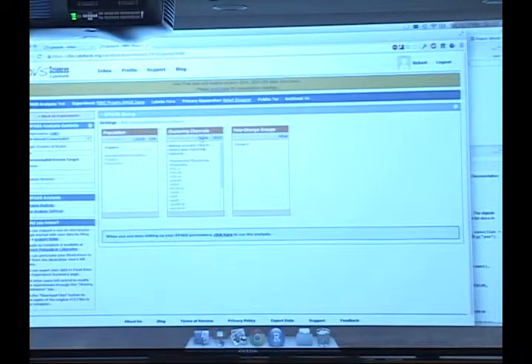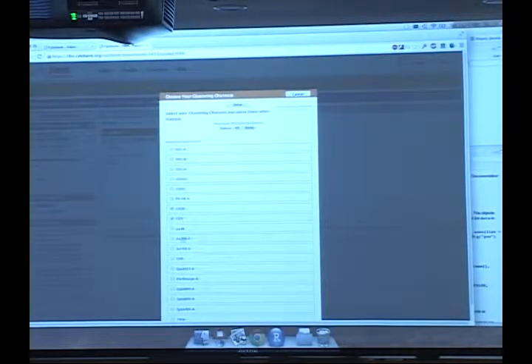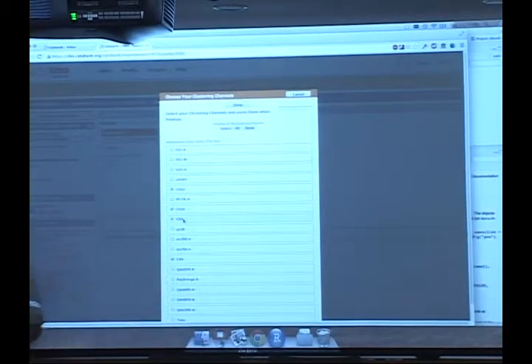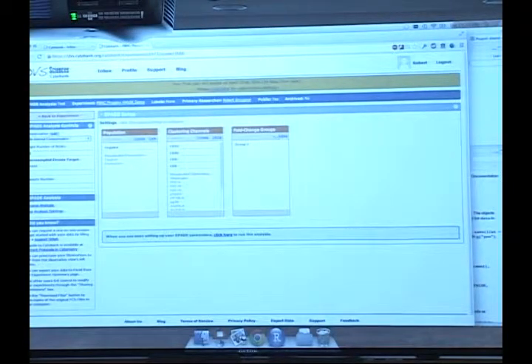So first thing we're going to do is select the clustering channels. So you can click Choose. And in this case, we're going to use the surface markers, CD3, CD20, CD33, CD20, CD3, and CD4. We're basically going to find cells that express similar amounts of these surface markers. And we'll say Done.